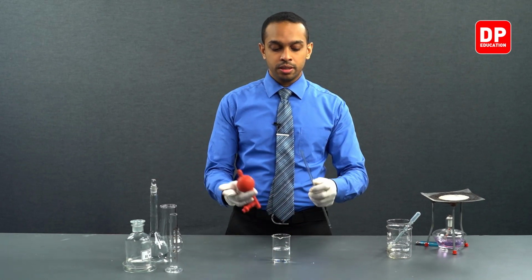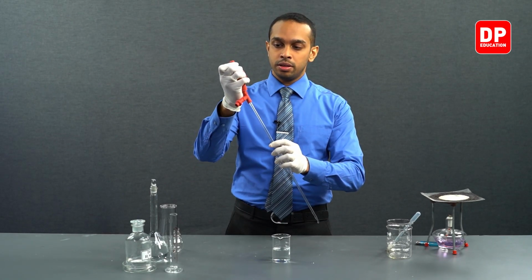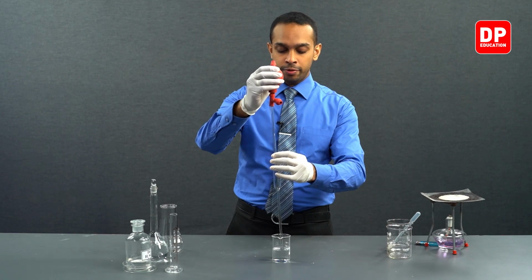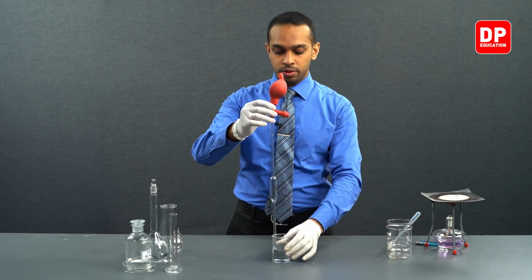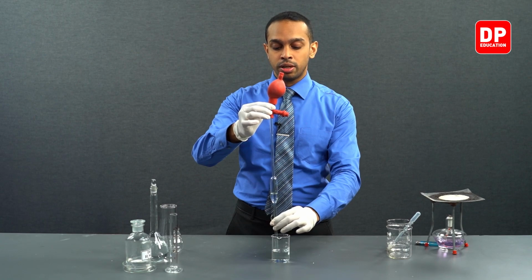We'll fix the pipette filler again like so. We'll again squeeze out the air in the pipette filler, and then we'll place the pipette into the beaker like this, and we'll draw in some potassium oxalate solution.